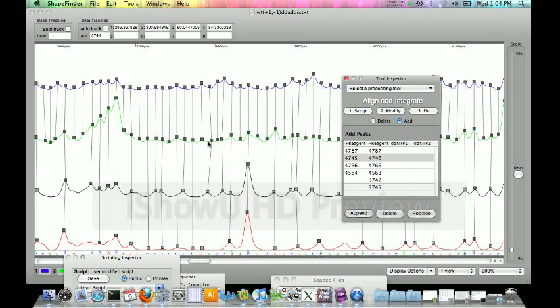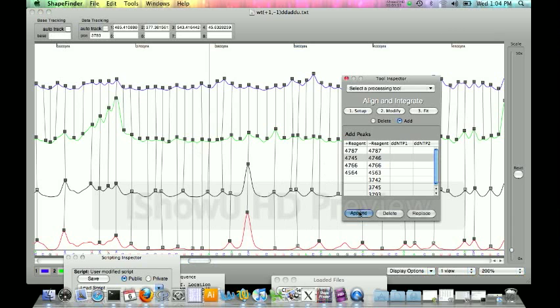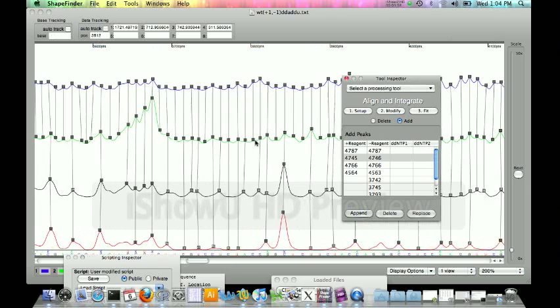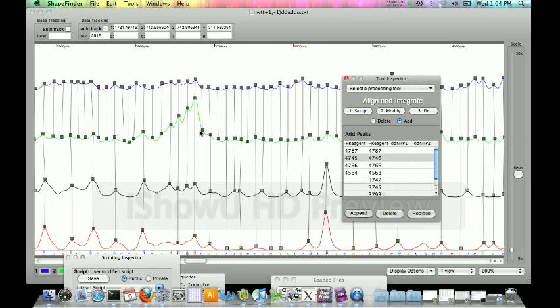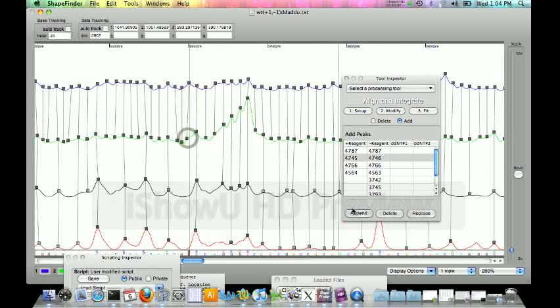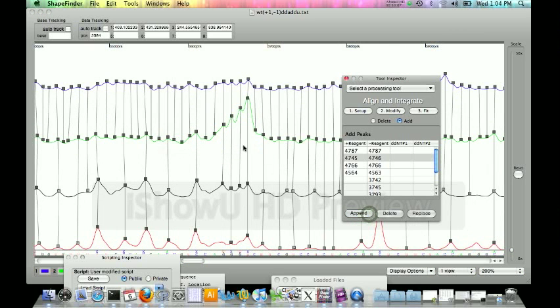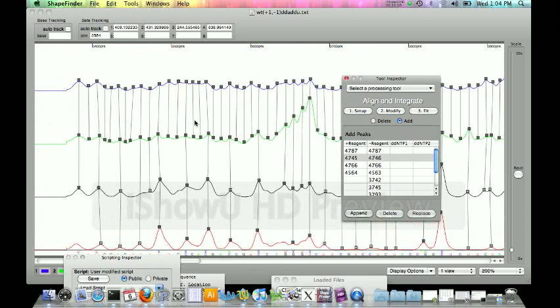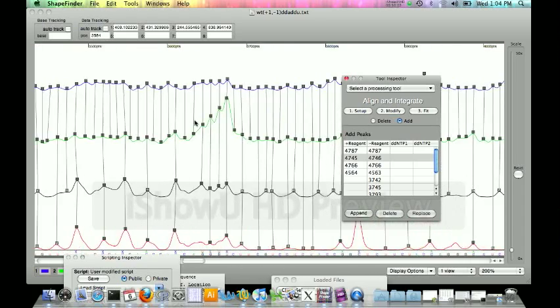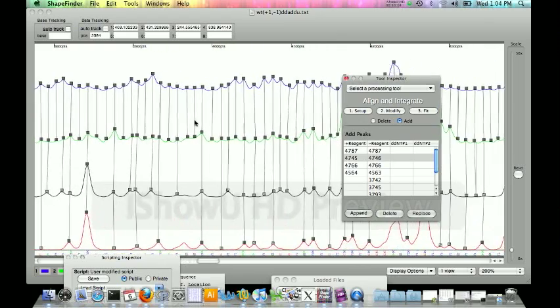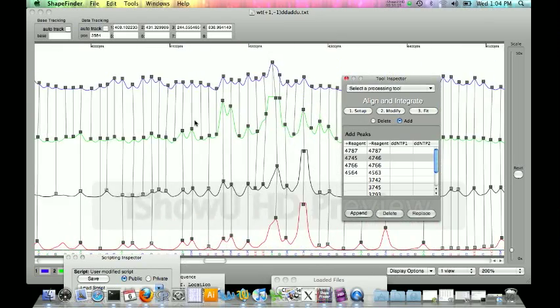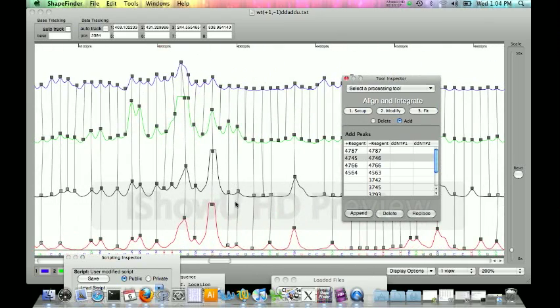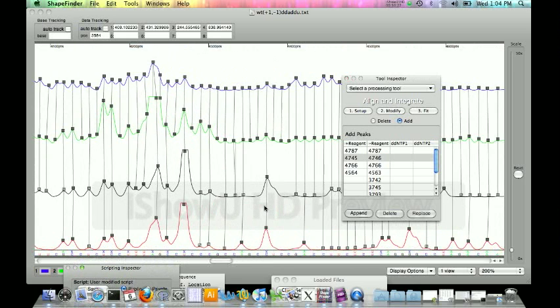We've got some crookedness in here, let's go ahead and line those up by clicking on the second filter. I'm going to straighten those out. Again we see some crookedness, some conjoining, where we'd really like them to be evenly spaced. So we're just going to space these out a little more. The majority of the peaks look all right. But obviously there are still some peaks missing because our sequence along the bottom here does not line up perfectly with the actual sequence itself.